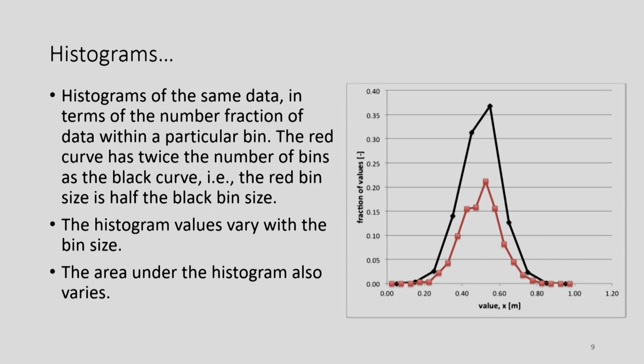As again I've written the notes here too, depending on the bin size that you use, the distribution might differ in a frequency distribution. Clear? If you are using a smaller bin size, then you might get a different distribution than if you are using a larger bin size, you get a different distribution in histograms.